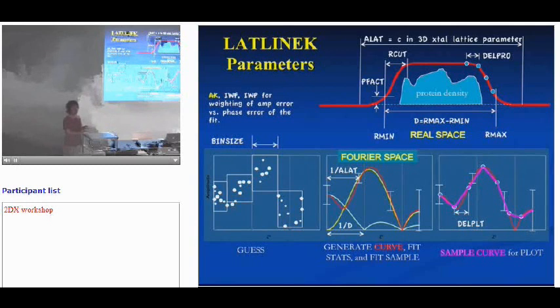It's going to apply half of a Gaussian function according to the values that you put in there. So you're going to end up with a function that looks like this. Once you start applying the tapering, it's no longer a square wave, so you cannot describe this in Fourier space directly as a sinc function.